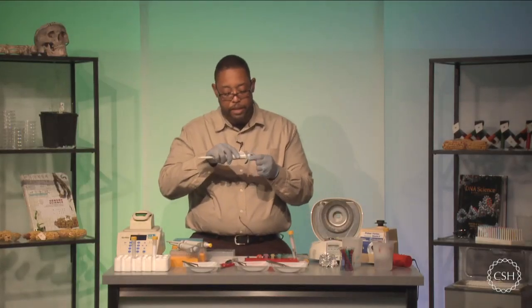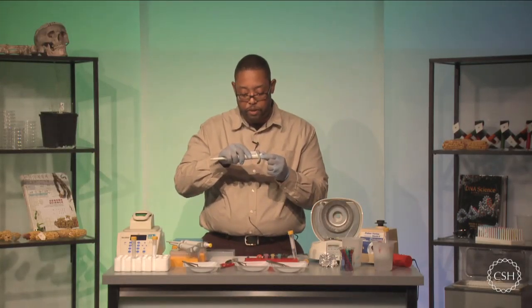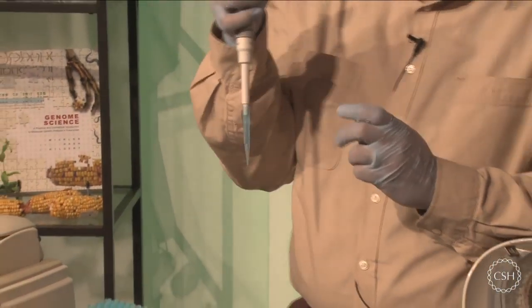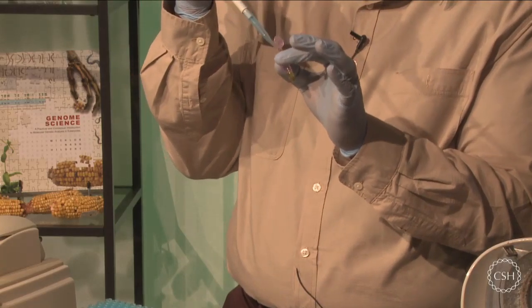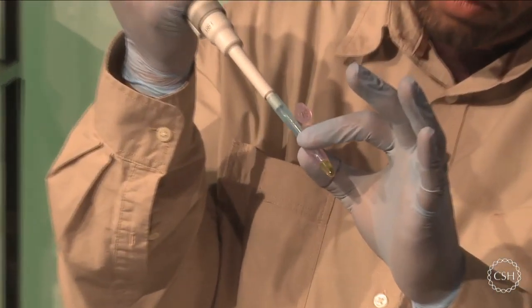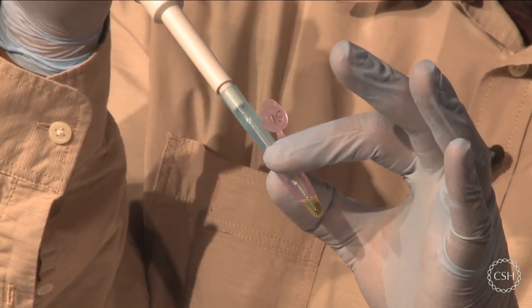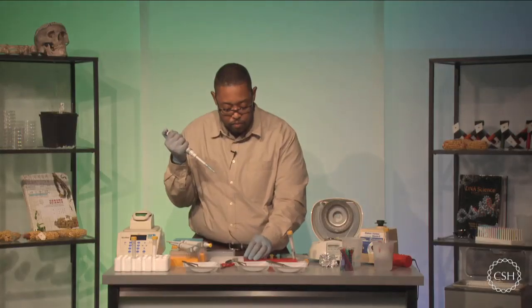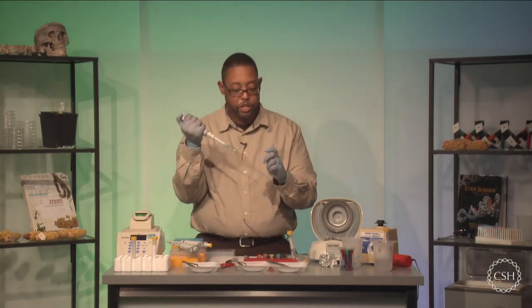So I'm going to set my pipetter down to 150 microliters. And I'm going to transfer 150 microliters of this lysate into a fresh test tube. Now be sure not to disturb the pellet at the bottom, because we don't want any of that debris. And I'm going to add this to a fresh test tube.